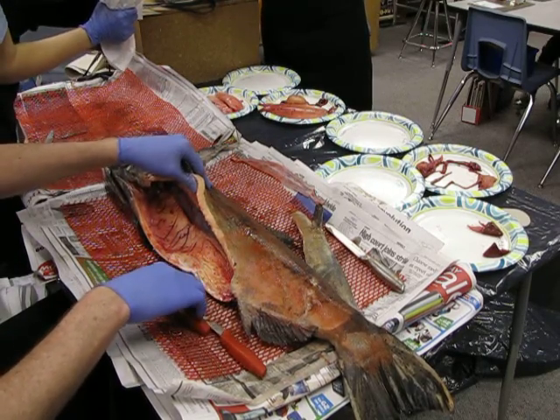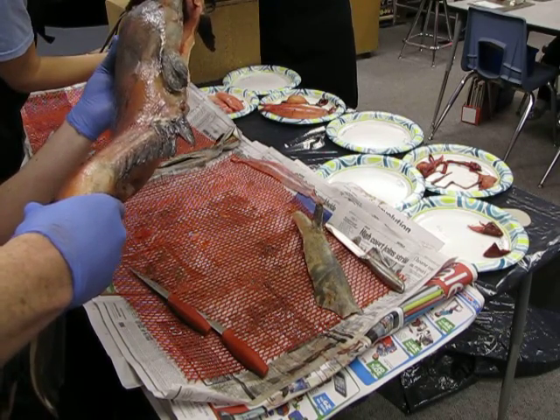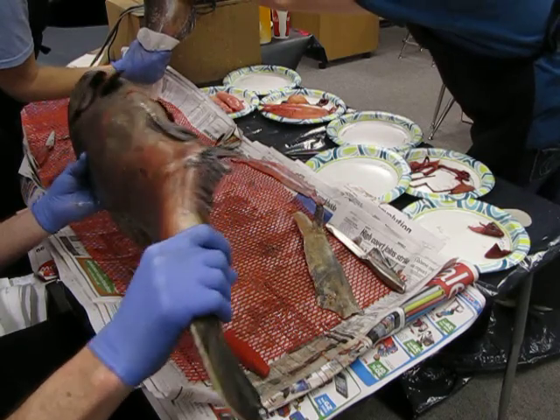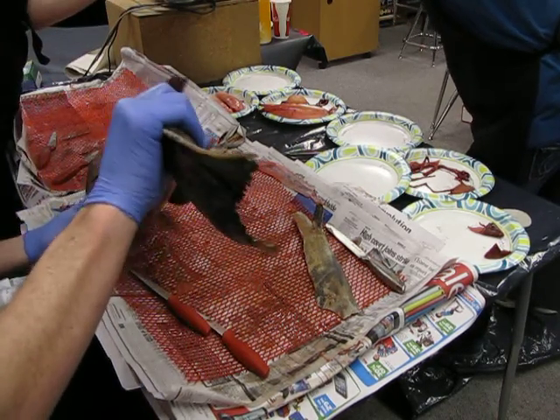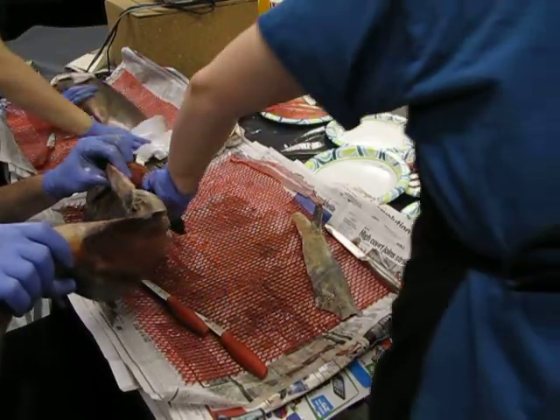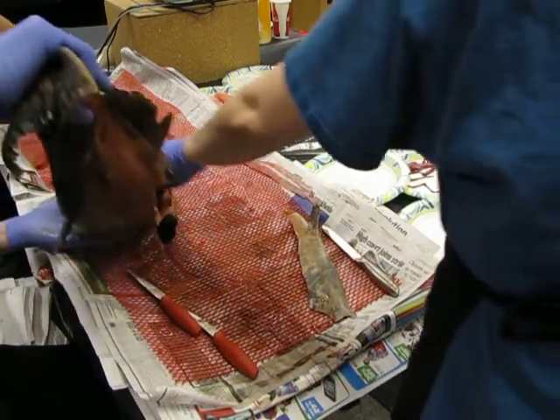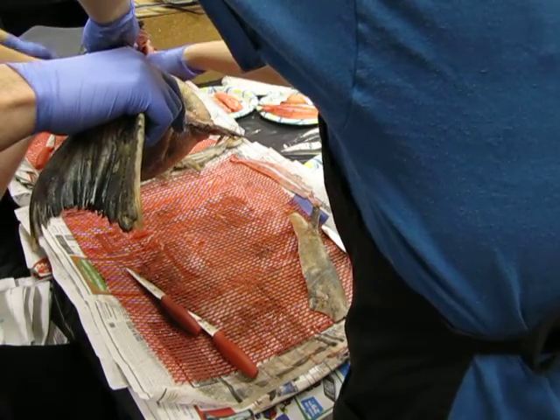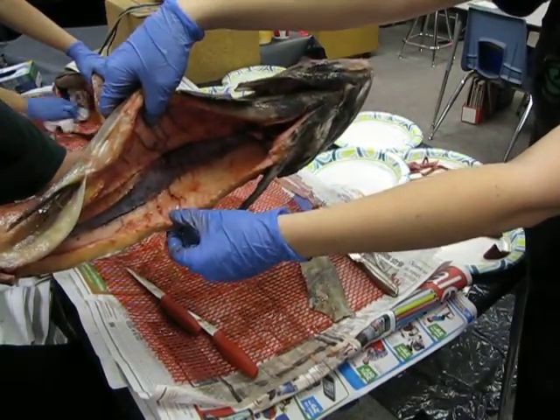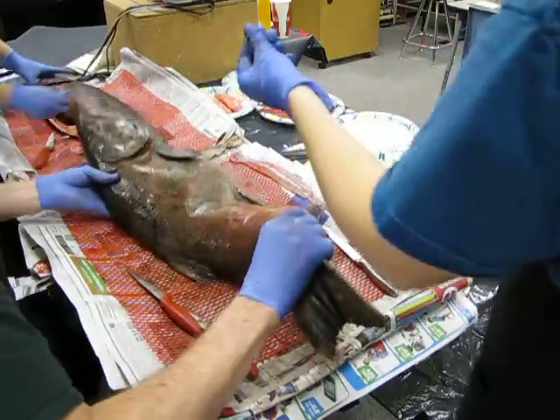If you can see inside of here, that's where she took the kidney from, the back of the salmon. She'll turn it so you can see everything. Everybody see? Raise your hand if you can't see it. You can see this one still has it in there. Stand up so you can see it. See, in Pat's, see where it's brownish right there? That's where the kidney is. He hasn't taken it out yet. Did you, in blue team, green team, see it? That's the kidney. All right, now sit back down. Fine job of observing.